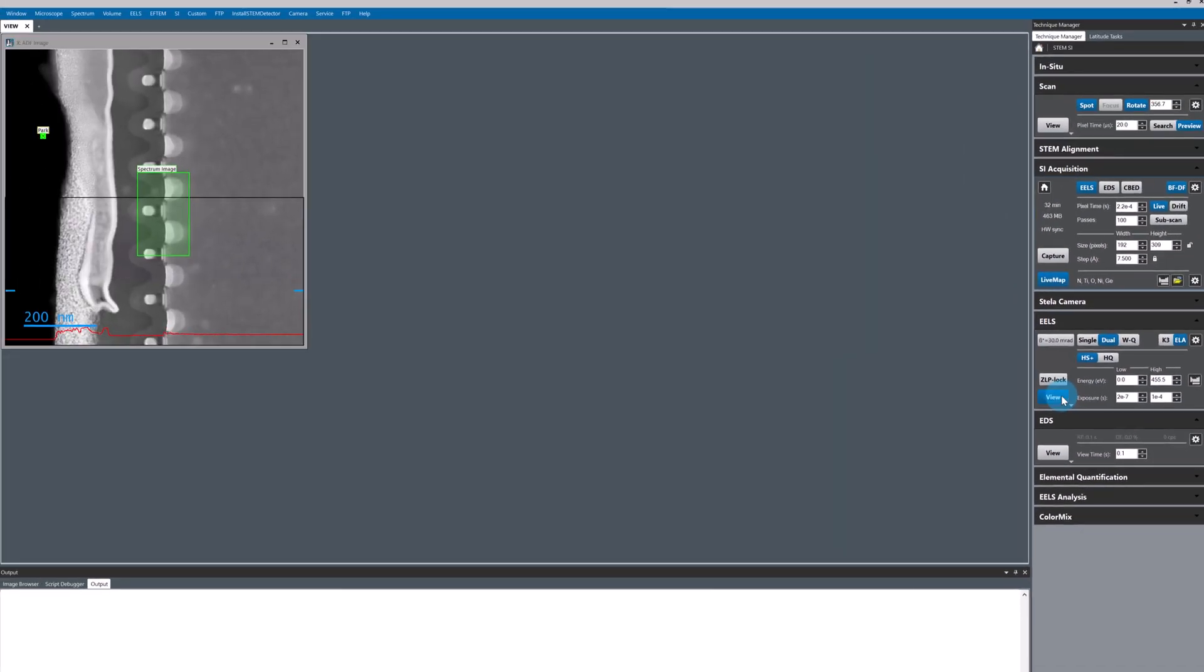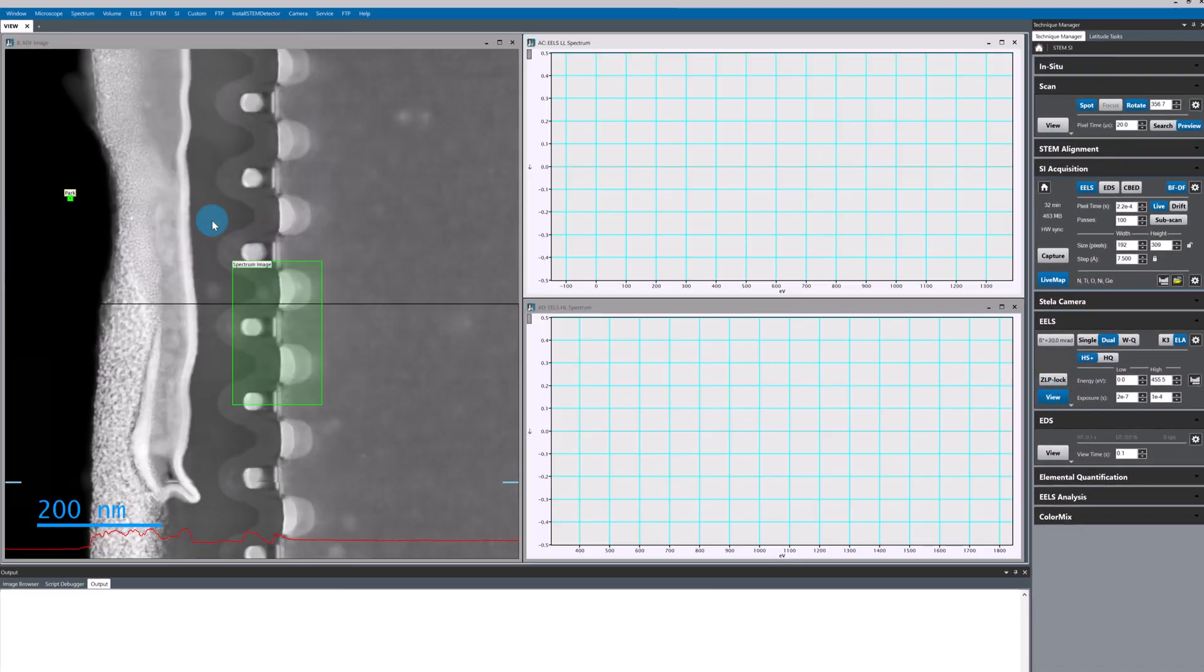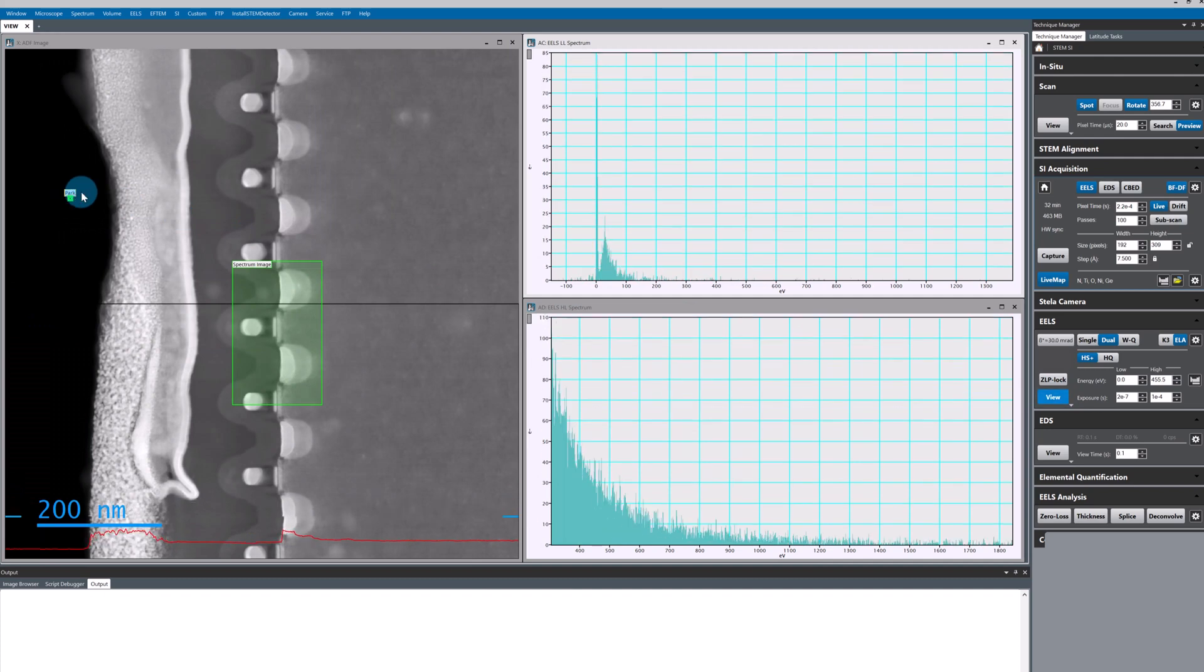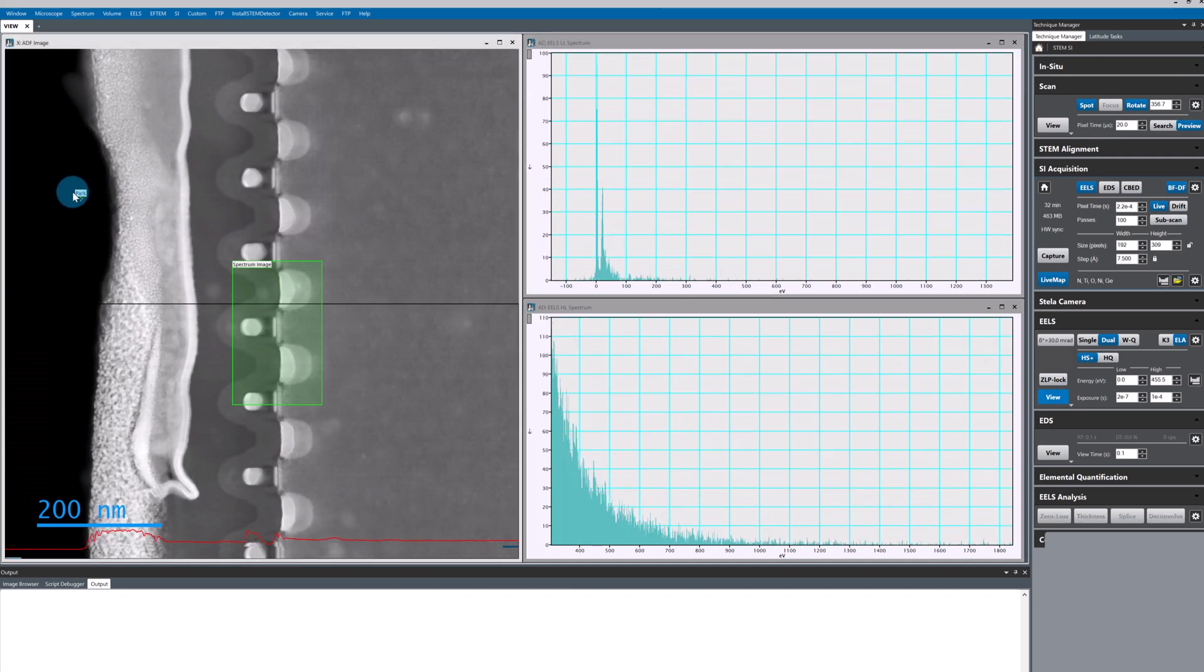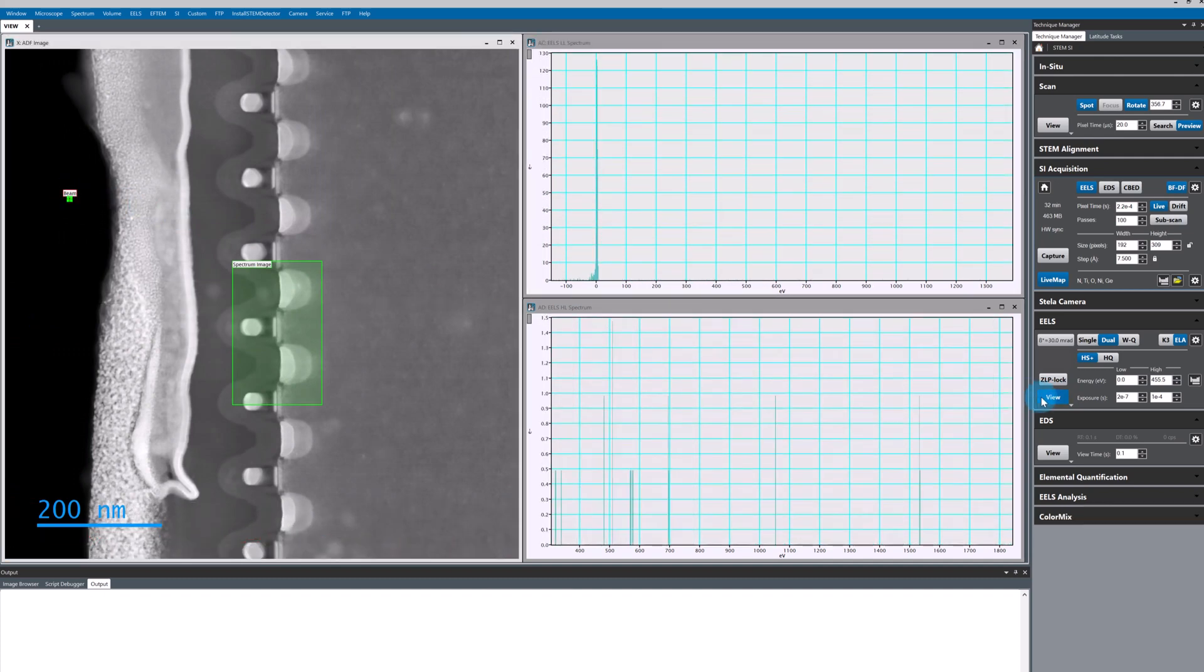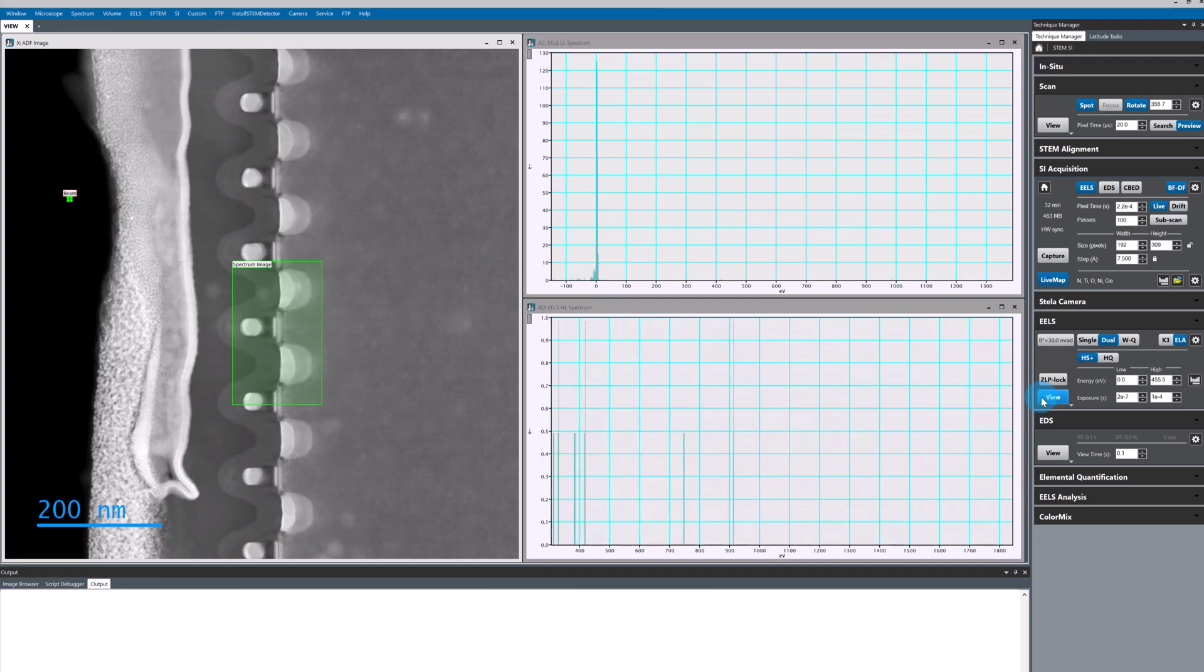For the high loss I've chosen 455 EV so that I can capture all of the ionization edges that I'm interested in for this semiconductor sample.